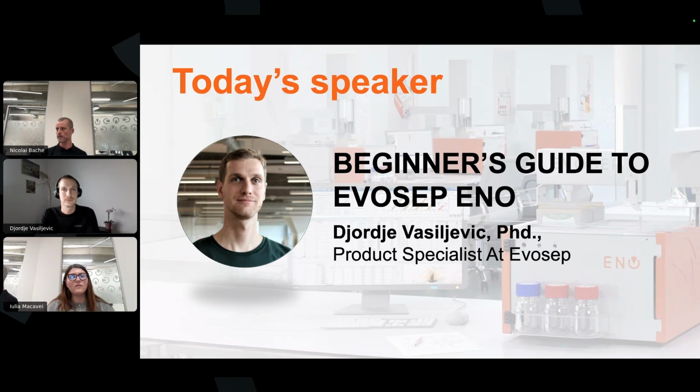Yeah, exactly. So a good question for you, Iulia, is how can we keep the Evosep columns after use? Is it possible to elute with higher organic solvent? So I guess the first bit, how to keep the columns after use? I don't think you have to do anything in particular.